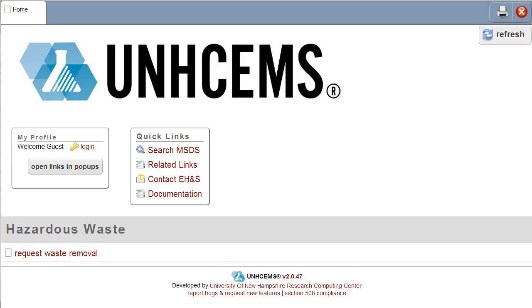In this video, I will show you how to log into the system. We'll review a user's dashboard and we'll look at searching the chemical inventory. Let's begin by clicking Login.